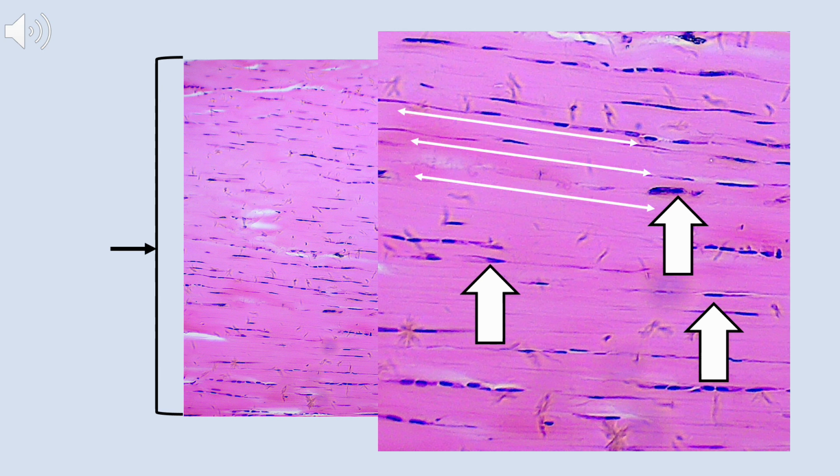So when there's a lot of tissue here, the pink, however, it appears to be extracellular. So that's making me think connective tissue is the primary tissue type. Seeing the parallel arrangement of fibers that run left to right on the screen, that indicates that this is going to be dense regular connective tissue. So this is likely from a tendon or a ligament in the body.